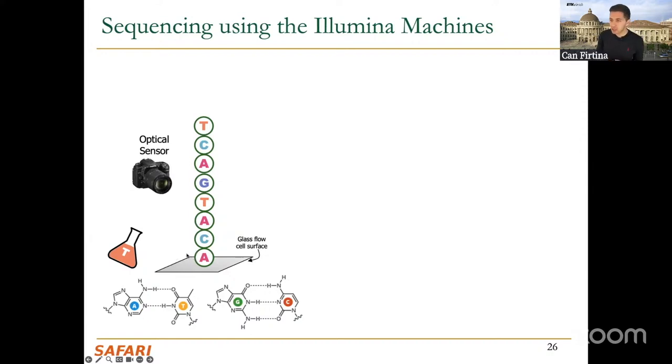And this is ensured so that it doesn't, for example, connect to this A or some other A, because the base over there is designed in a way that the T and A connection should be made over here, because there's a particular chemical connection here, such that it won't happen here, but it will happen here. We know that chemical connection type, and that's how we ensure that this T will bind here.